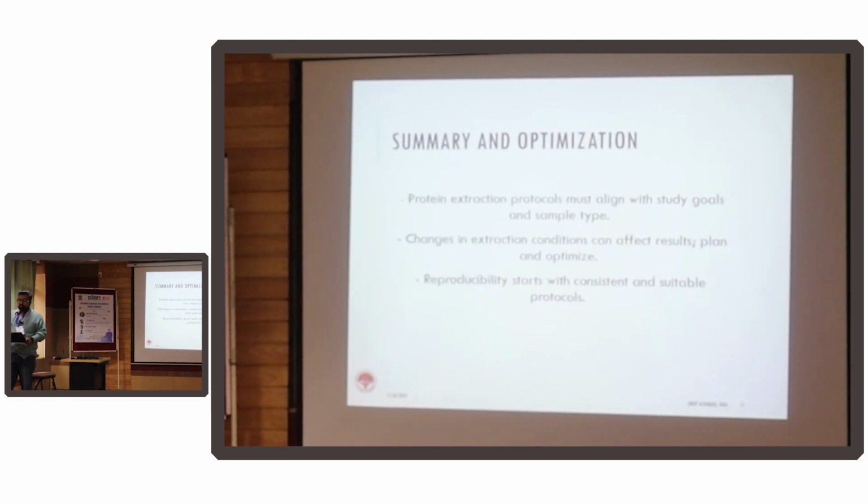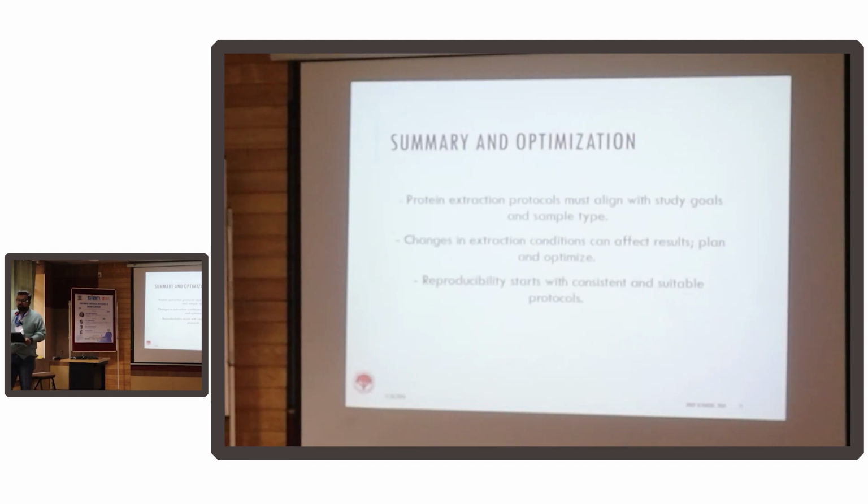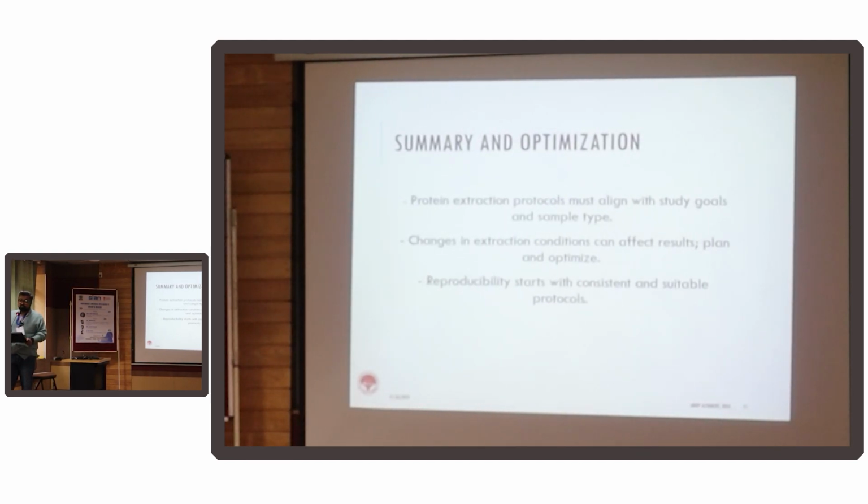Your lab might move on to another protocol. Maybe your young friend who is starting off with the PhD can move on to a newer protocol. You should not. And that's true even for software like MaxQuant that we will be discussing. So throughout your analysis, use only one version of MaxQuant.